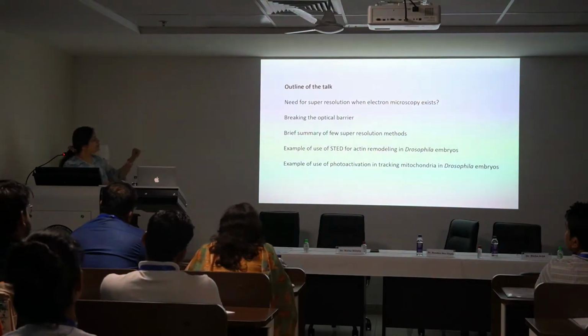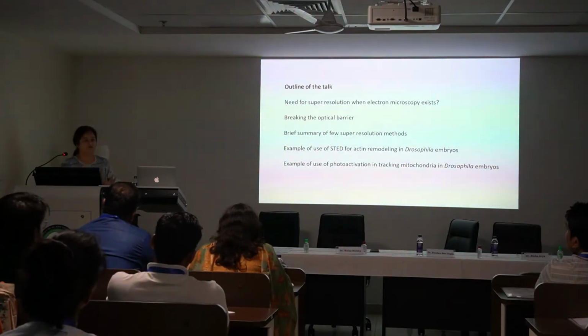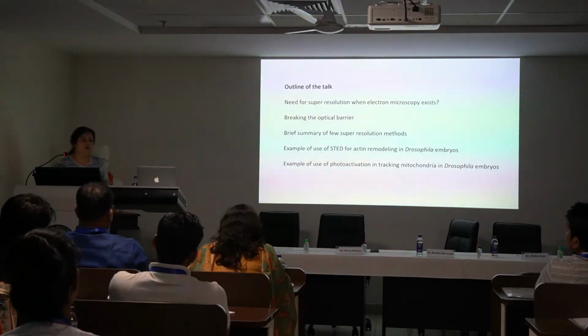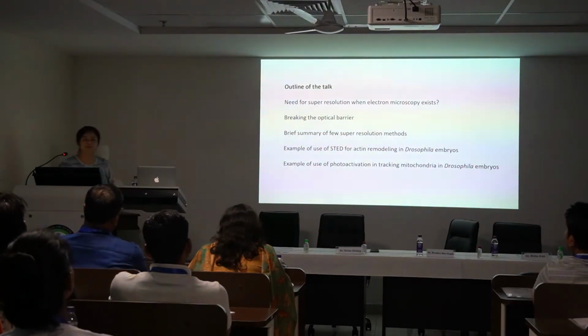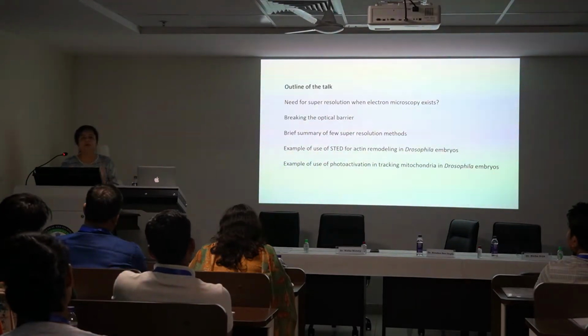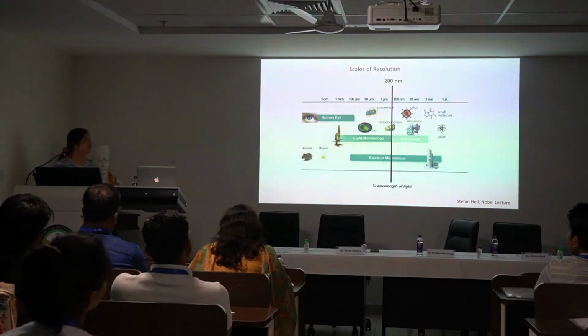And what I'm going to do is give you a brief summary of a very few famous and upcoming super resolution methods, practically just 3 of them. There are more than these which are being worked on as we speak. I'll give you an example of STED and how we have used it to image a certain process in embryo development. And I'll give you an example of how we have used photoactivation to image embryos live, and then the use of photoactivation in one super resolution microscopy, which we've not done, but that is something which it led to, and hopefully will lead to.